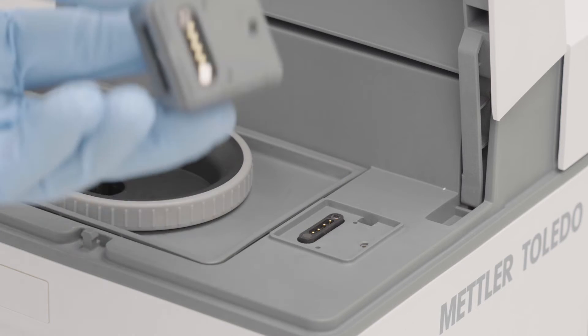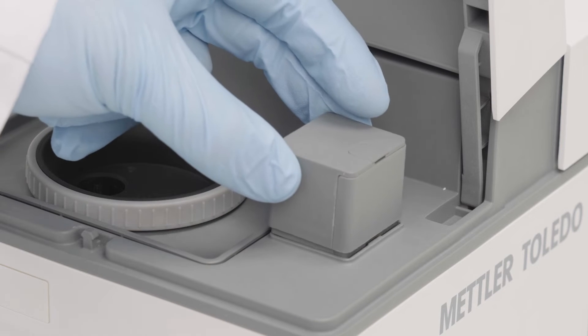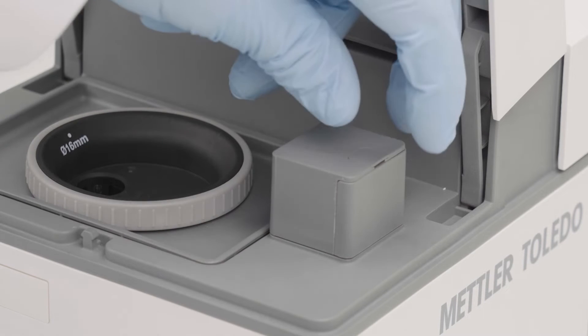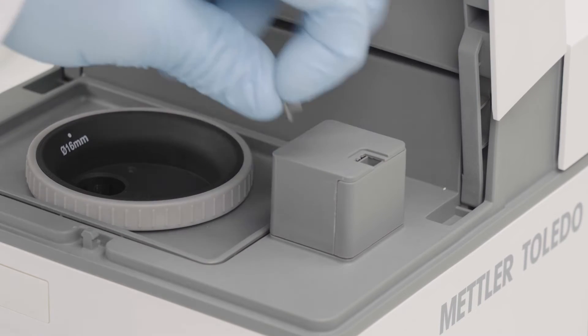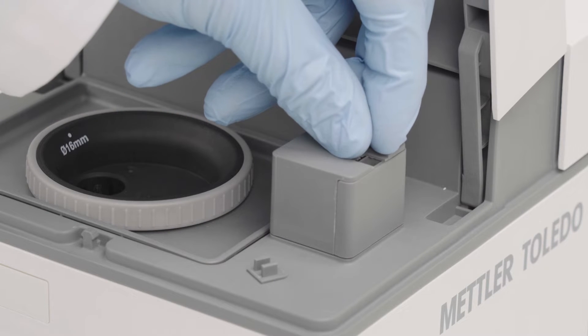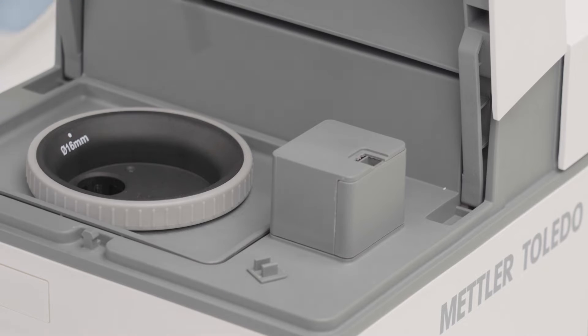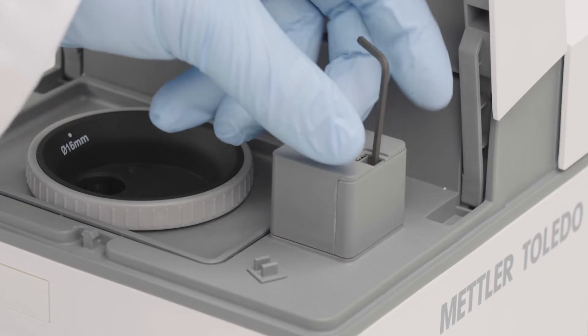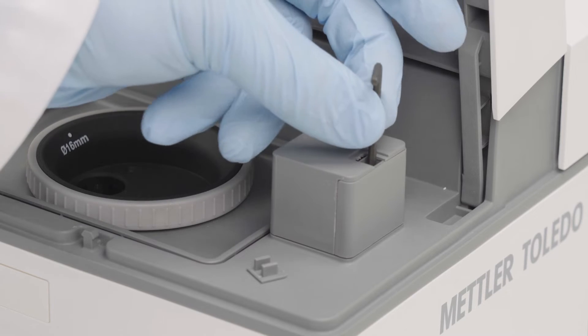Mount the SQ-Kit reader on the magnetic pogo pins. Use the delivered screw to fix the SQ-Kit reader. Tighten the screw completely to ensure the correct positioning.